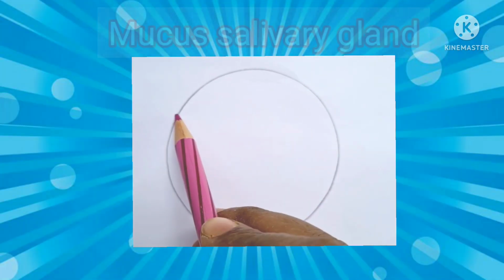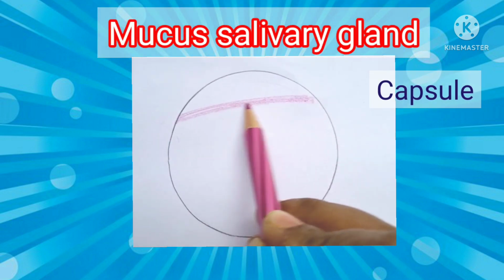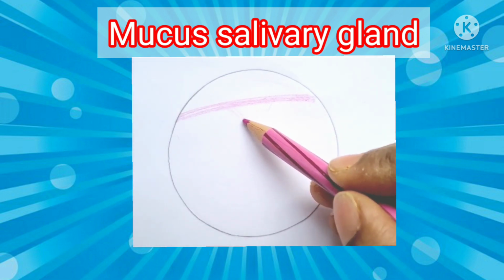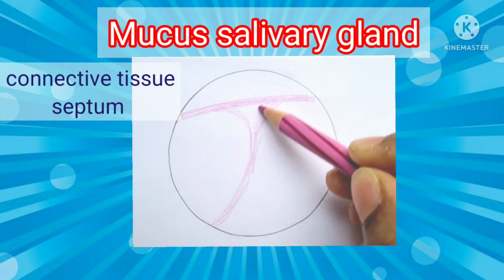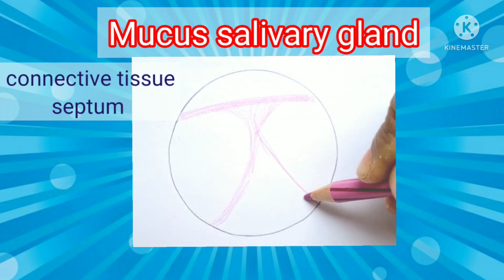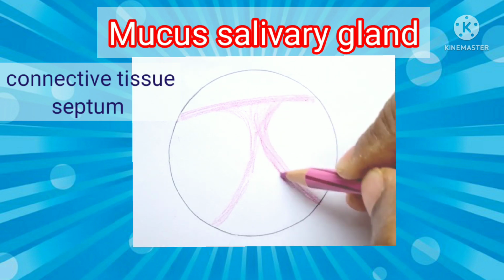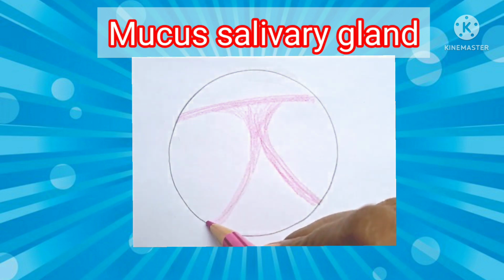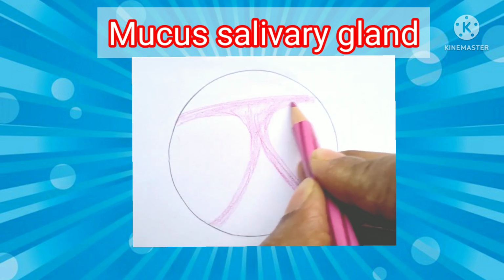Now coming to the mucous salivary gland, the basic architecture is the same. The major salivary glands are surrounded by a capsule. An example here is the sublingual salivary gland. The capsule sends septa, which divide the gland into lobes and lobules. So the interlobular ducts and the major blood vessels are seen in these septa.